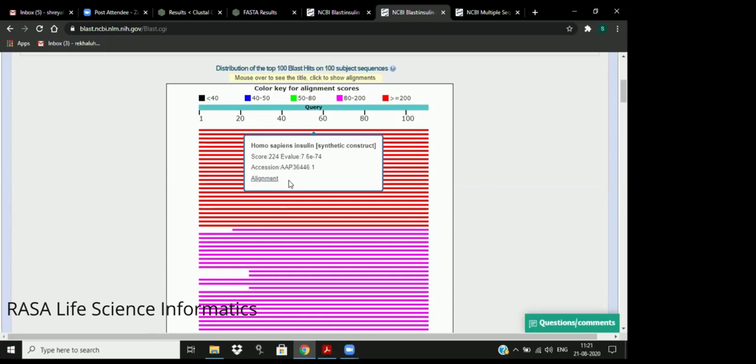Supposing that whatever I have clicked right now was red in color, that means it is having the best score. I picked it from the top results and it is having the red score. So this means that this is good data from where I should predict the data, right? Supposing there is one red line and one black line, obviously, what will be your preference? The red line, because the score is quite high in that case. So I have also picked up one line like that.